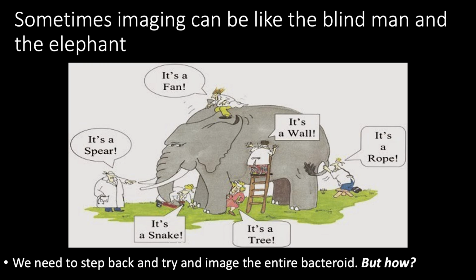And the difference is, the gaps between these bacteria are much, much smaller. So we really do need to use electron microscopy. And when we're thinking about these bacteria, it's a bit like thinking about the blind man and the elephant. So we're looking at all these different bits, and I was showing you there's some bumpy bits, there's some bits that look like they might be dividing. So, you know, what's really going on?